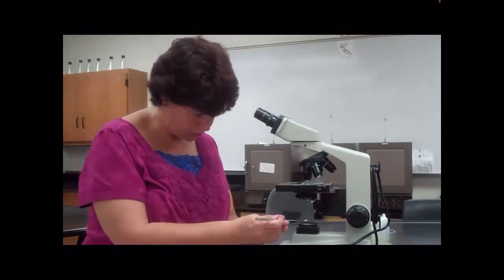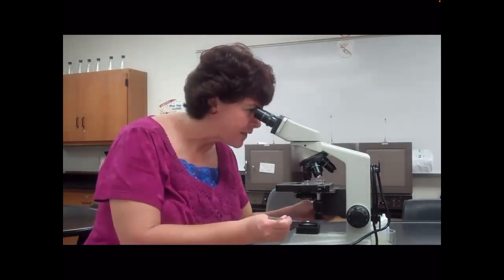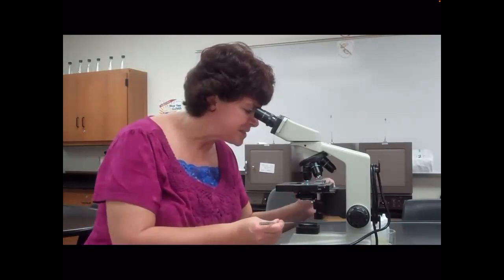Now, to see if your condenser is the right place, take your loop, hold your loop over the light source, looking through the microscope, try to focus on the loop. It'll be a little bit blurry. So what you can do is you move the condenser until your loop comes into focus. Your specimen will go out of focus. Once that's done, that's exactly the perfect place for your condenser. So if you do that at the beginning of a lab before you do any microscope work, you're going to have better focusing. It's a little trick that I learned. It takes just a minute. If you skip it, you might have issues with focusing.